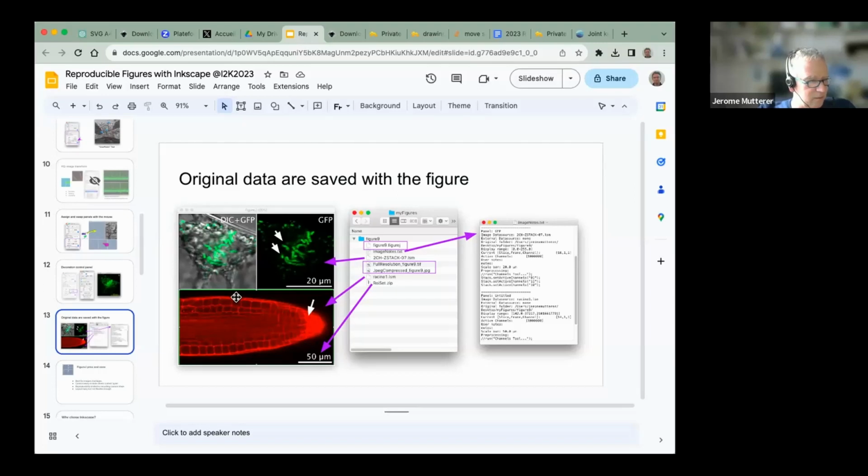You have to mix a different kind of data, not just images. I was stuck with just microscopy images, but nowadays any scientific figure will include tables, plots, special visualization from the bioinformatics facility, from R, from Python, from whatever. So you want to mix a lot of different content from different sources.